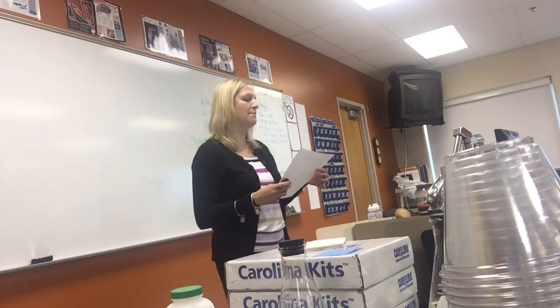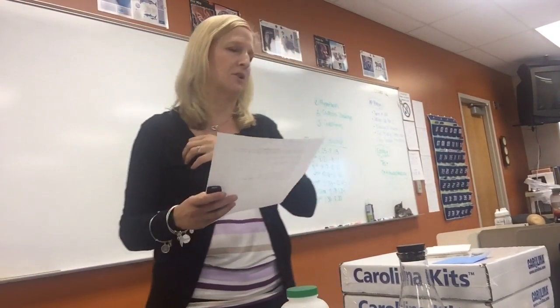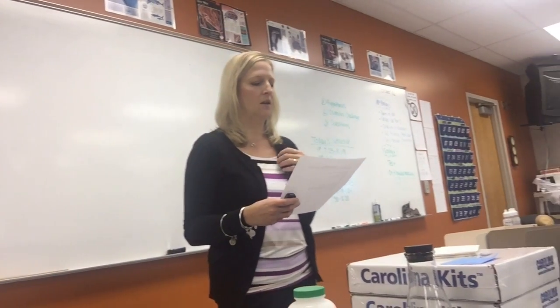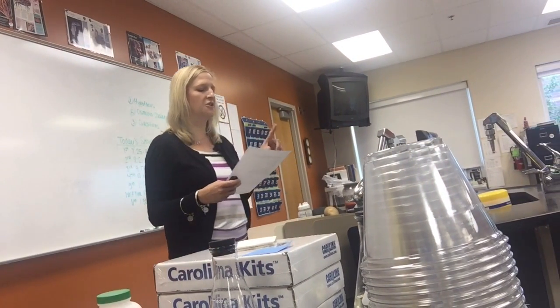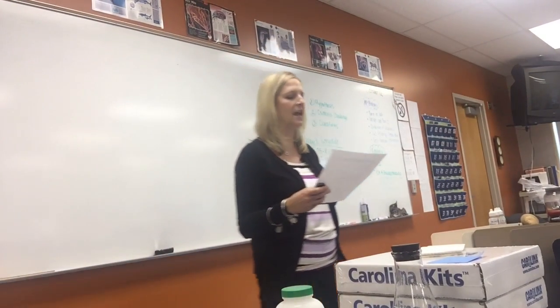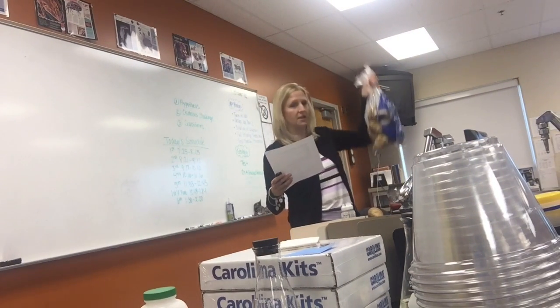Beakers is on there twice. If you cross out that second beakers, it's a graduated cylinder is what you need to put there. That was what I meant to put there. See how beakers are on the list twice? All right, so you have graduated cylinders, you'll have balances, the same two that we used for our previous lab. You have potatoes, they're just normal, everyday Idaho potatoes here. And those are the potatoes we're going to be using.